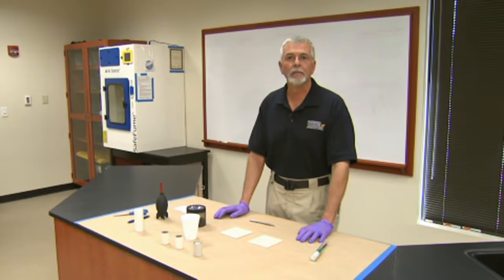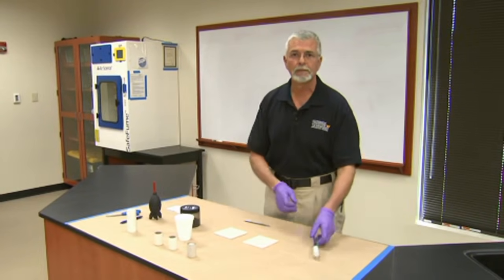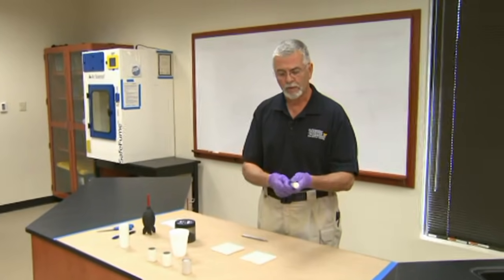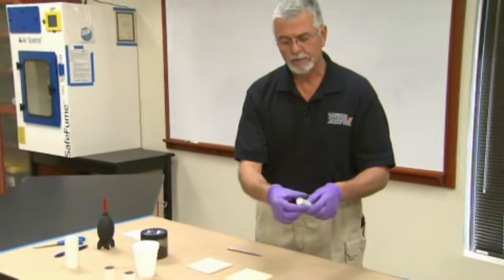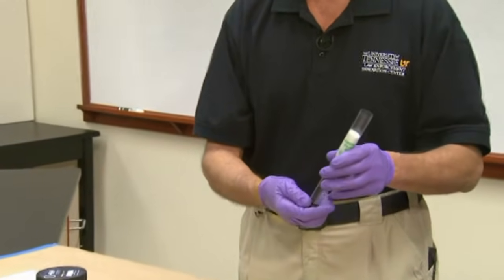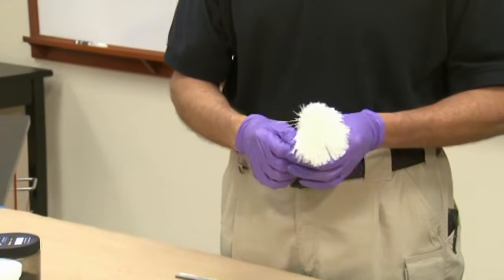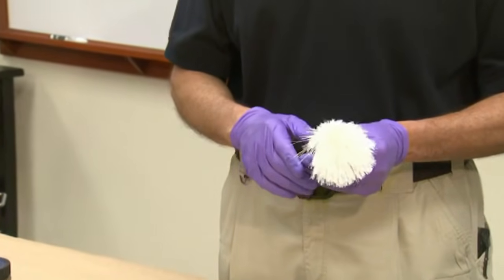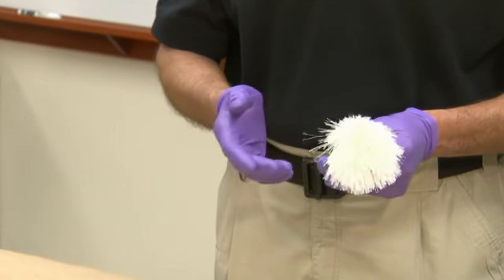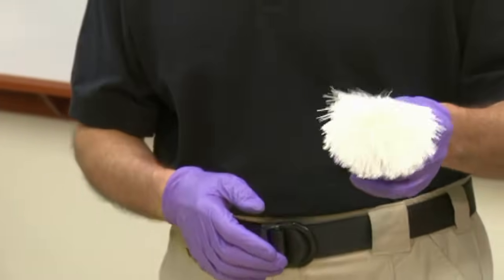We're at the National Forensic Academy and what I'm going to demonstrate is how to use a non-magnetic fingerprint powder to possibly develop latent fingerprints. One of the first things we want to consider is the surface we're going to process. We'll use a non-magnetic powder if we have a nice smooth surface. For a rough surface, we'll select a magnetic powder.